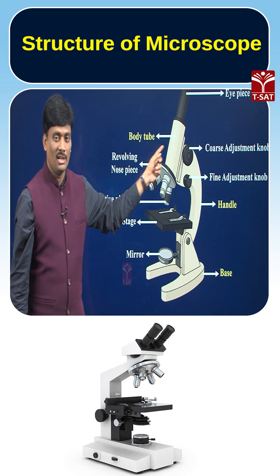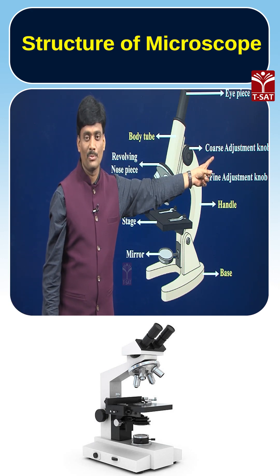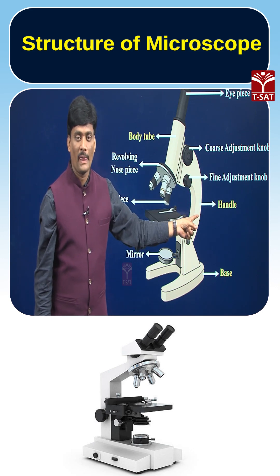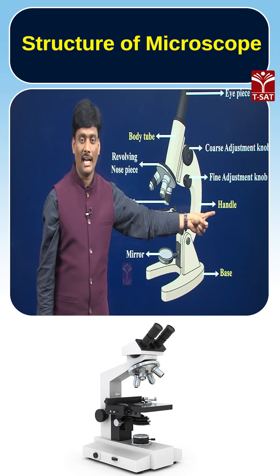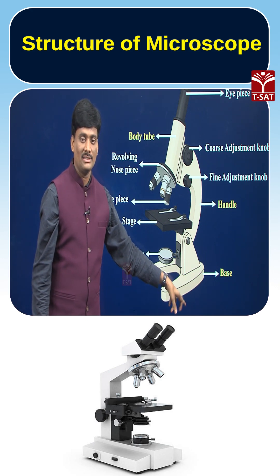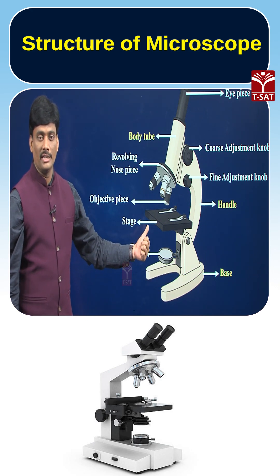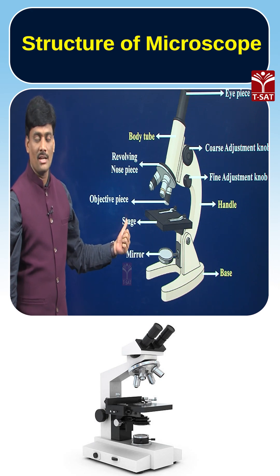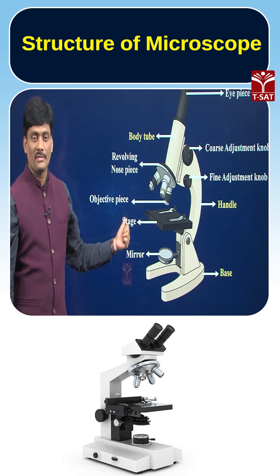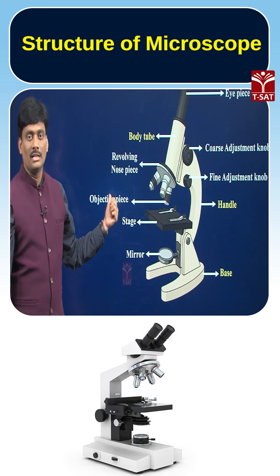Now you can observe the parts present in a microscope. Here is the body tube, here is the eyepiece, the coarse adjustment knob, the fine adjustment knob, and here is the handle. Here you can see the base, and this is the mirror.